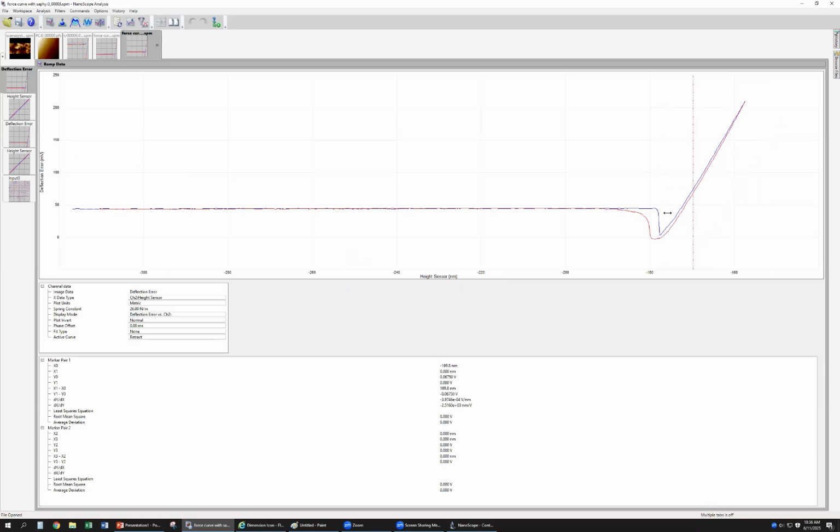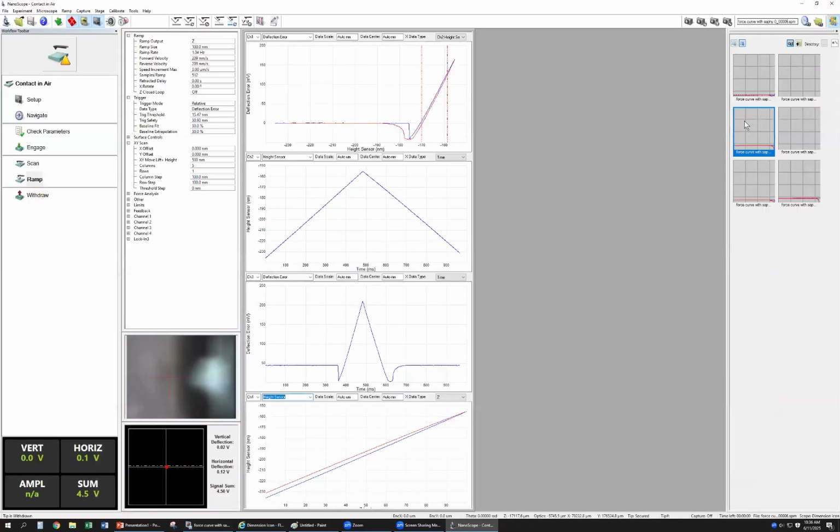This is the second. It's updated sensitivity. This one is 88. Then you can get the average, 92 plus 88 divided by 2. Okay. So that's how we get the average deflection sensitivity. This one is one method from the contact model. This one is more accurate.